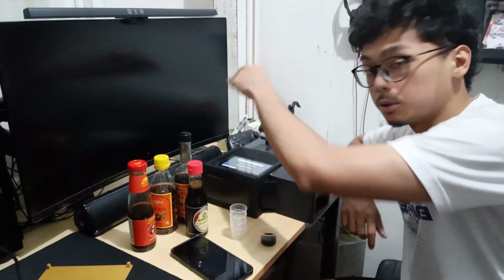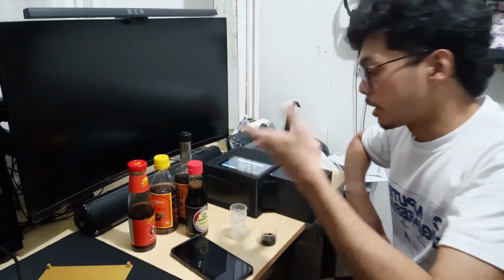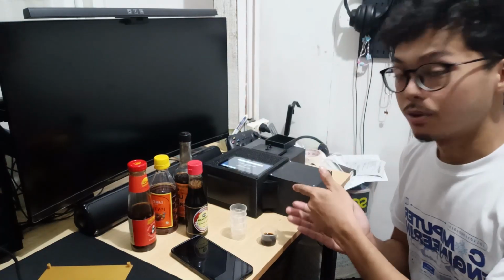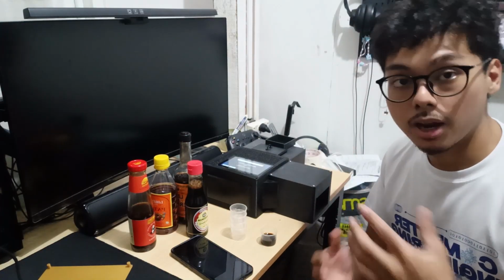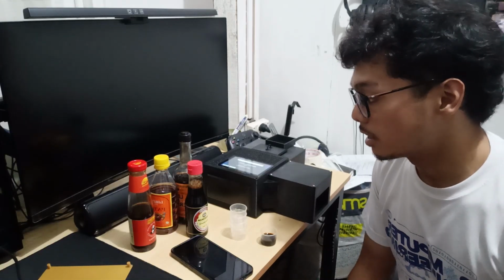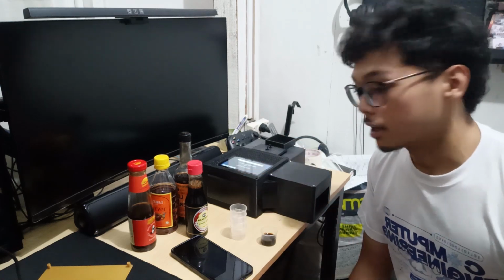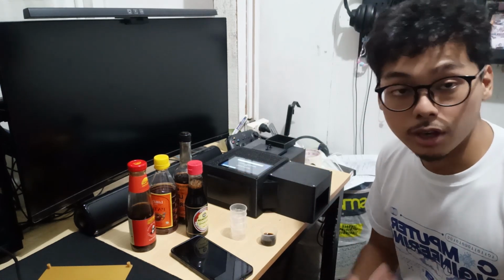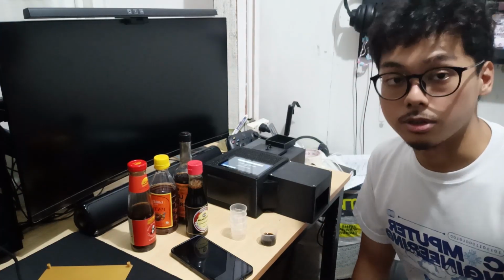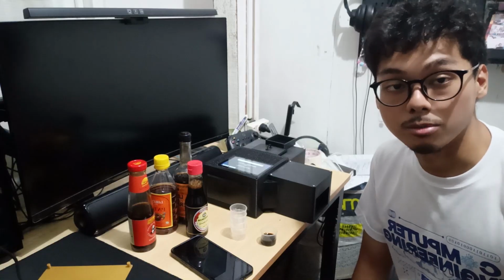Then I'm going to turn on the exhaust fan and then let the exhaustion process run. We're gonna wait for these sensors to normalize or go back to their normal values, and then after that we're going to try the Worcestershire sauce next, and hopefully the classification is going to be correct, and then after that the fish sauce and then the oyster sauce. So I'm going to see you guys in a bit after the exhaustion process.